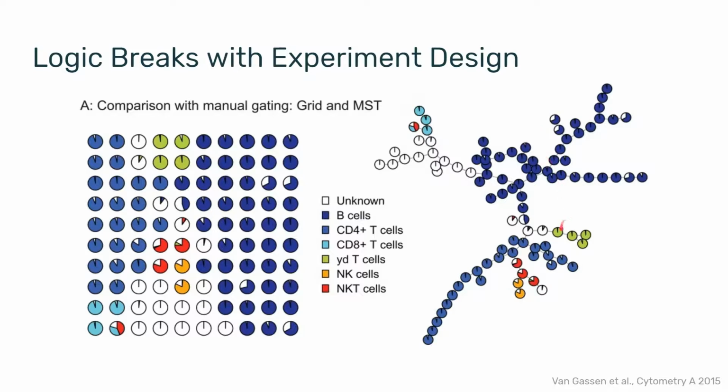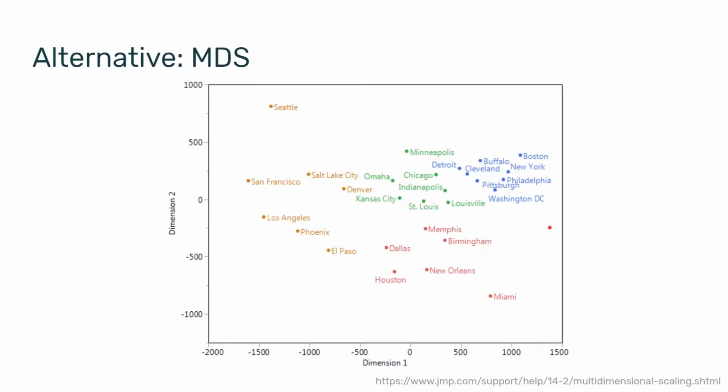We can color code this by different markers, and we will get a good representation of the different cell subsets. If our goal is to label clusters, then this could work. However, it could lead to some confusion. And furthermore, it is common to see these weird situations where a given cell subset might break, and one half of it will go into one branch and the other half would go into another branch, and there might not be biological meaning behind it. It's just fluctuation or noise in the data. So here is another suggestion.